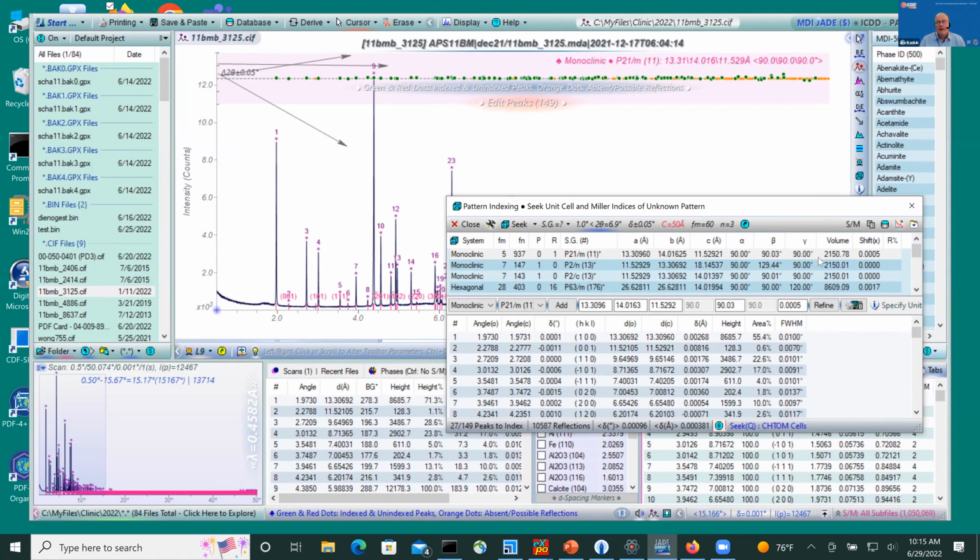The volume is such that there are 4 molecules in the unit cell, which is nice for an orthorhombic, but it turns out that this weak little peak is 001, and that violates the orthorhombic symmetry. So it really is monoclinic, and it really is about 90.03.